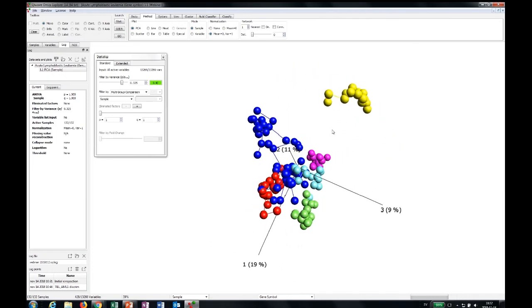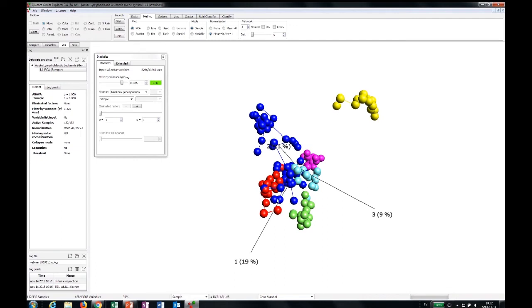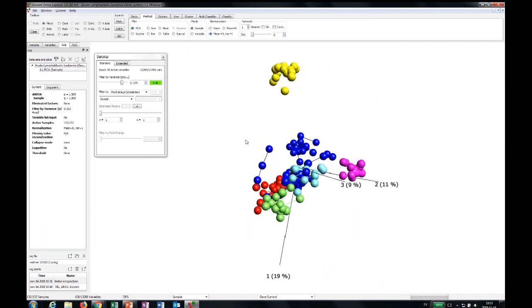I'm not sure you remember, but this was the result of the initial inspection that we did. We had found these groups, we have the variance filtering, and we have the networks. And then most importantly, when you have restored a log point, you can continue the analysis from that point. So it's not a screenshot, it's actually a full restore of all settings in the program.